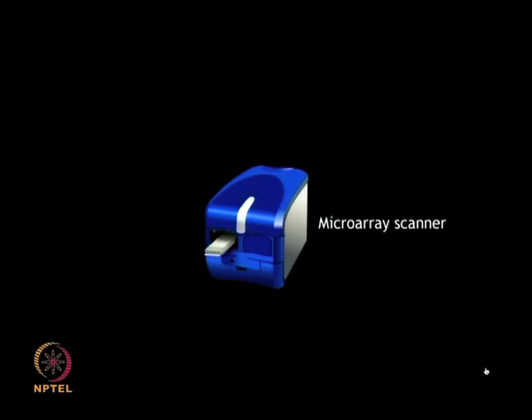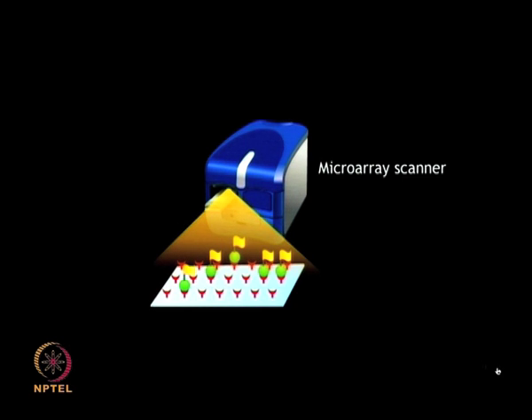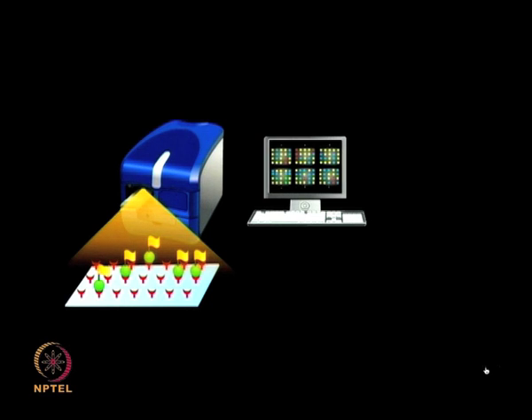Antigens were tagged with Cy3 and Cy5 fluorescent labels. After the antigen-antibody binding reaction was complete, the excess unbound antigens were washed off by using phosphate buffered saline and water at room temperature. Once the excess antigens were washed off, these slides were scanned at wavelengths of 532 nanometers and 635 nanometers.